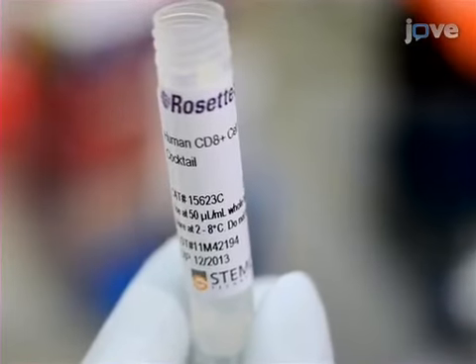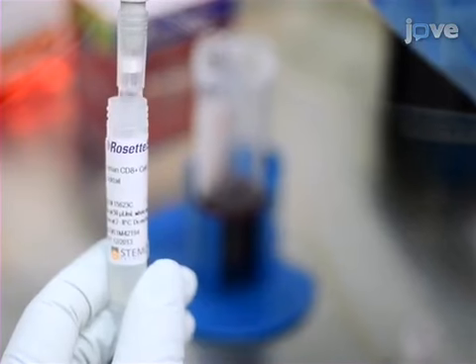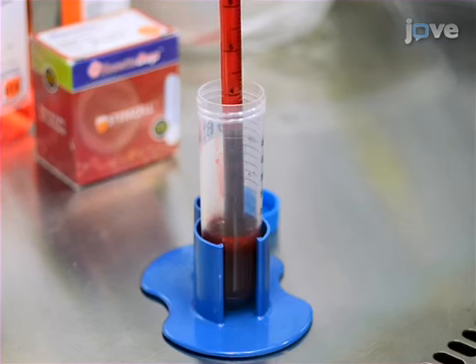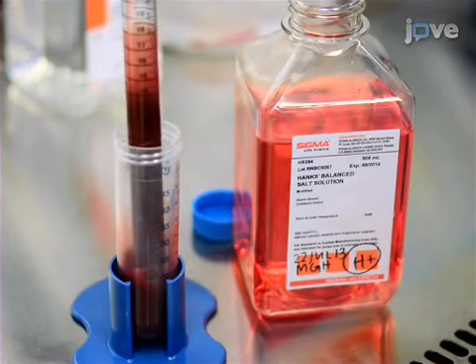Deplete the CD8-positive T cells by adding the human CD8-positive depletion cocktail at 50 microliters per milliliter of whole blood. Mix well and incubate for 20 minutes at room temperature. Mix the whole blood with Hanks buffer.